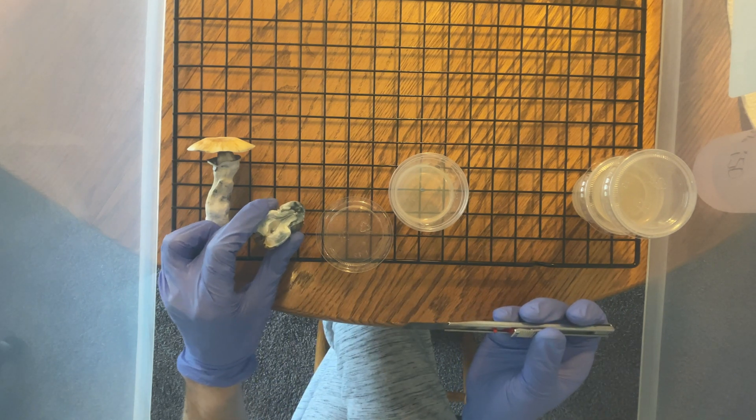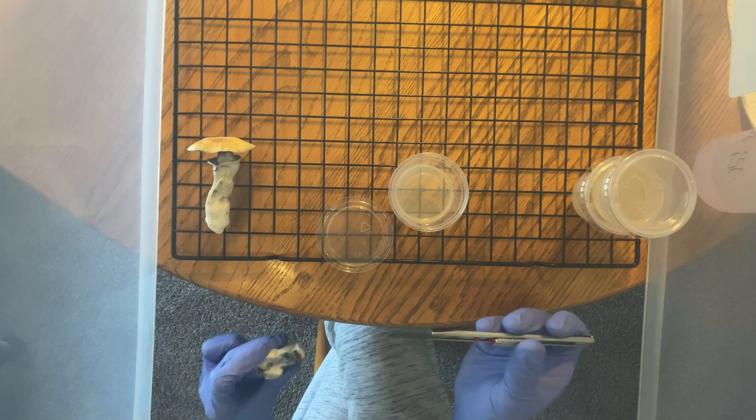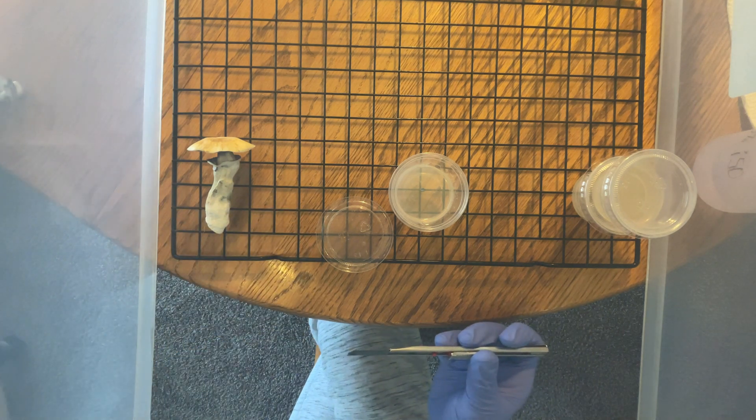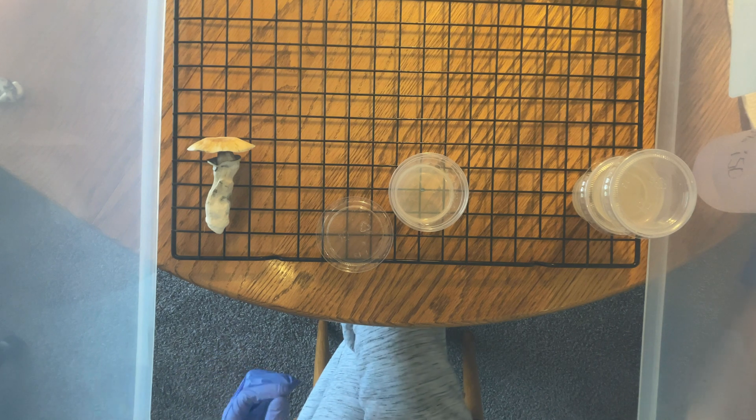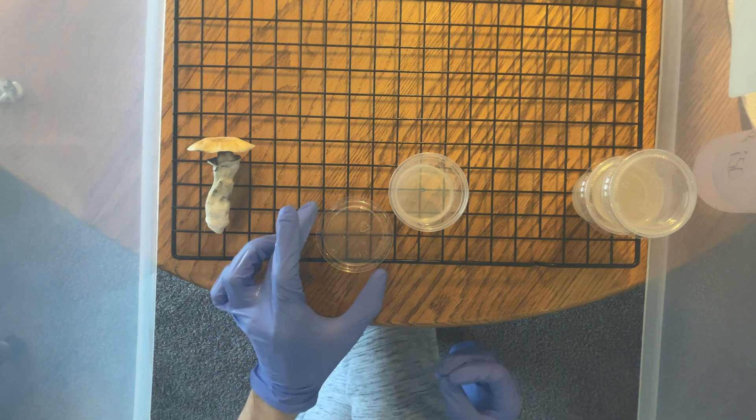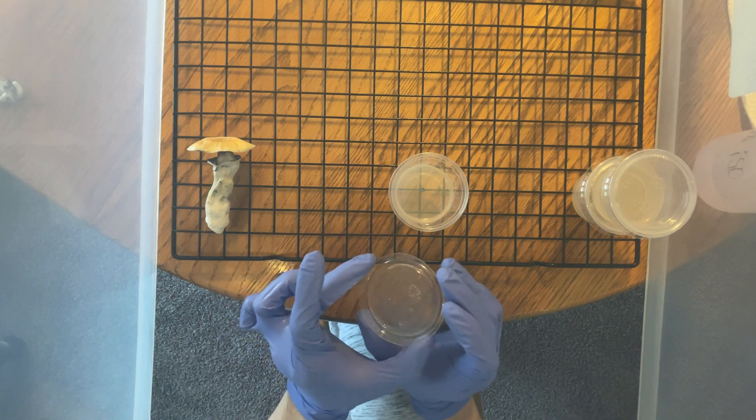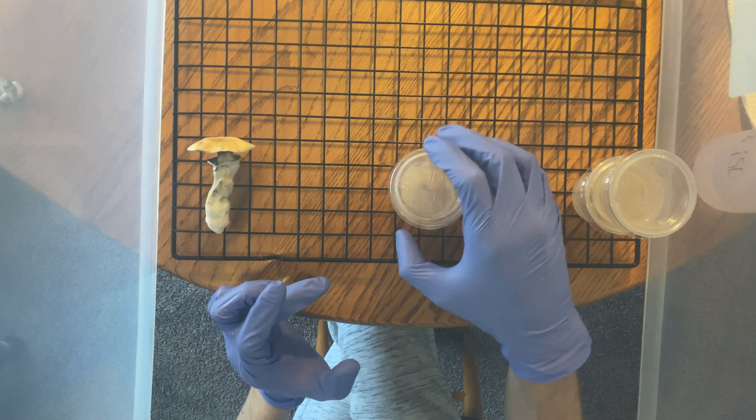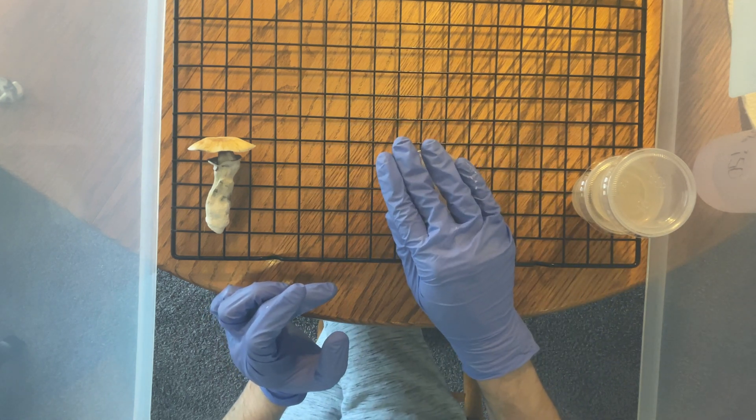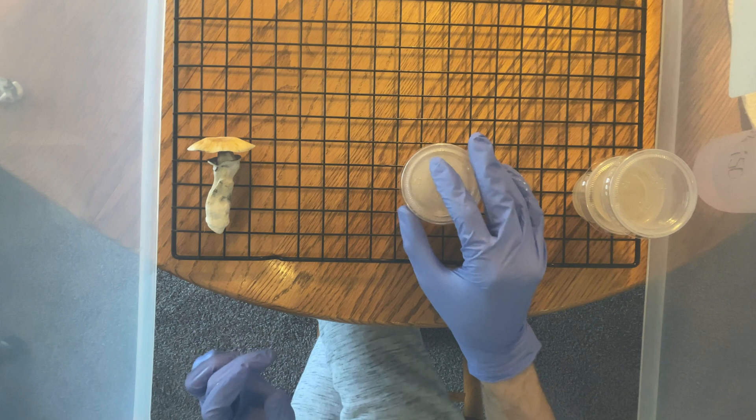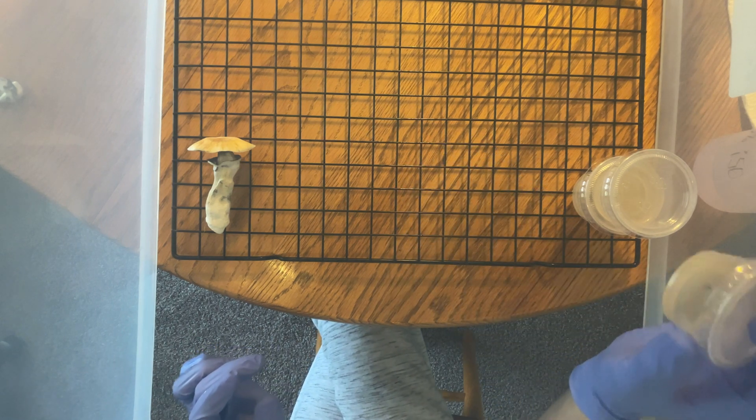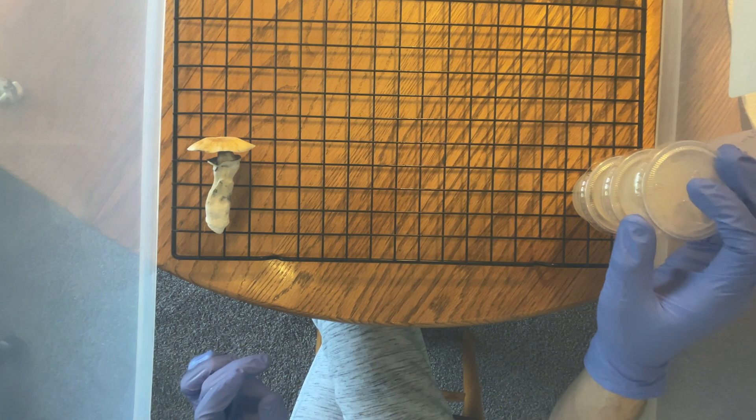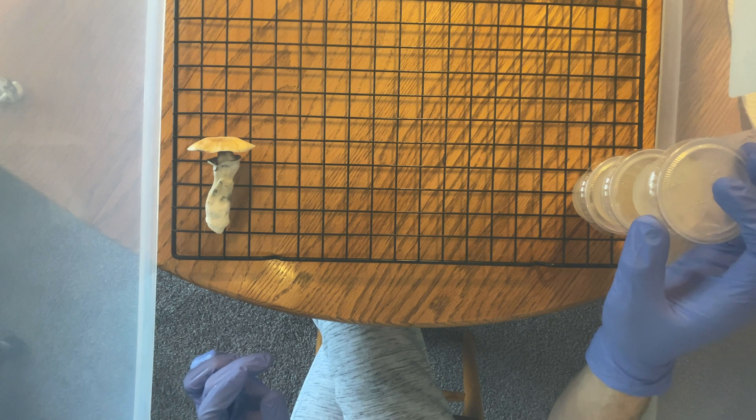I'm also taking my fruits out of the bin, just so that I have a little bit more of a work area for my next fruit. Lid back on. And now I'm just kind of trying to figure out an order for my plates, just so I don't get mixed up since they're not going to be labeled.